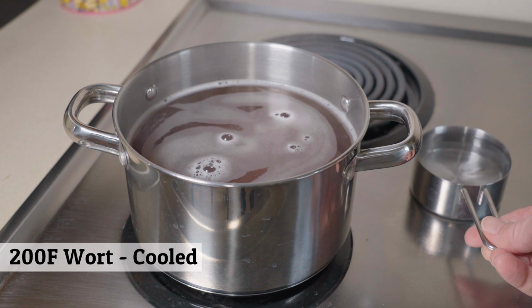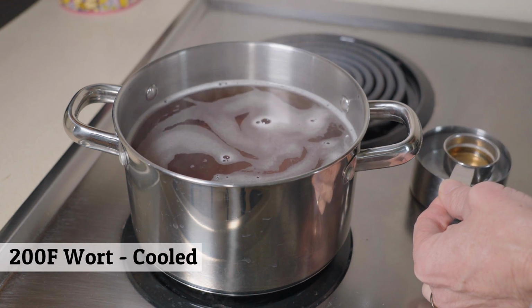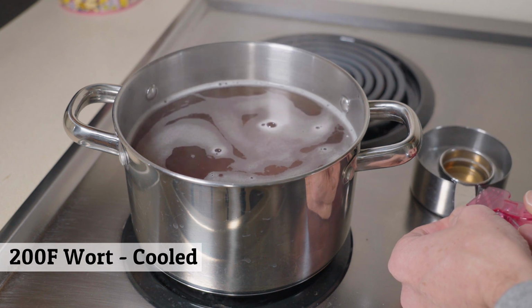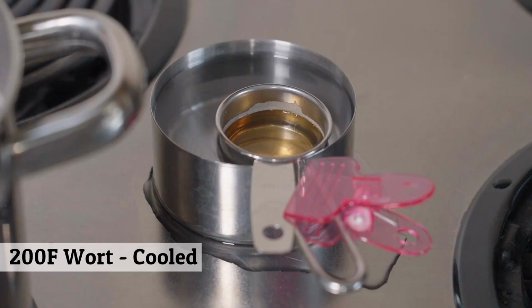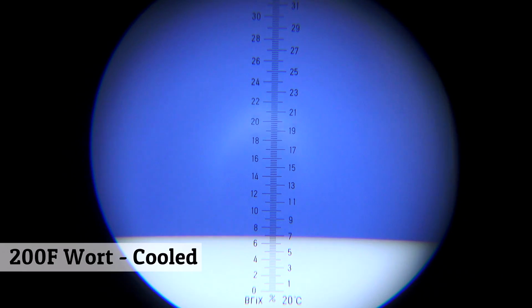Now we're going to go back to the cooled sample in a larger container. The larger sample size helps control the evaporation. And here we are at room temperature, or 75 degrees Fahrenheit, as we defined it. And we'll take our sample, put it on the platter. And here we are coming in at 7 even. So this is still not as accurate as the direct sample taken from the wort right on the platter. So that's a good thing to know.